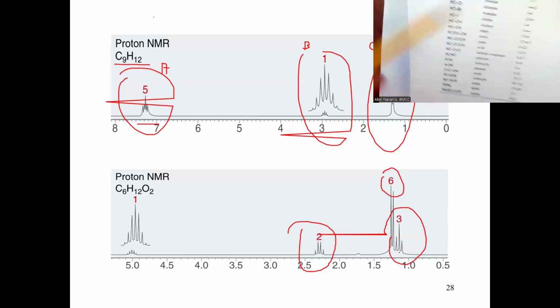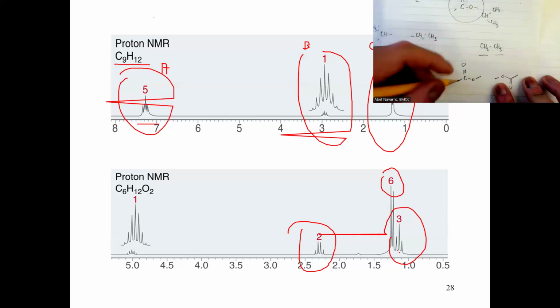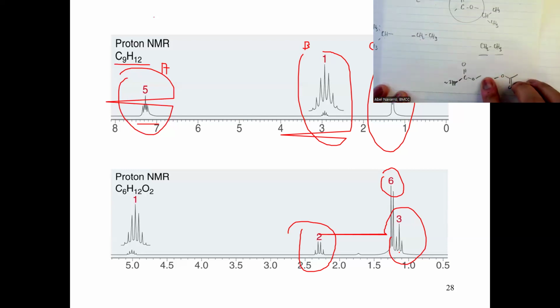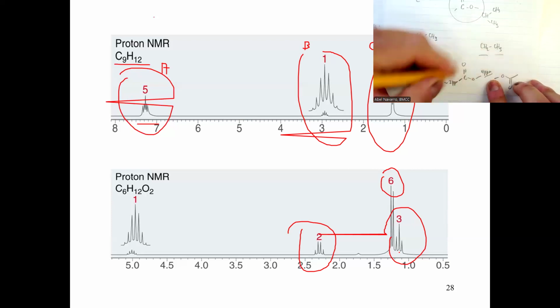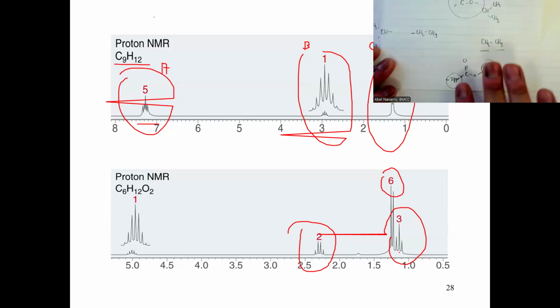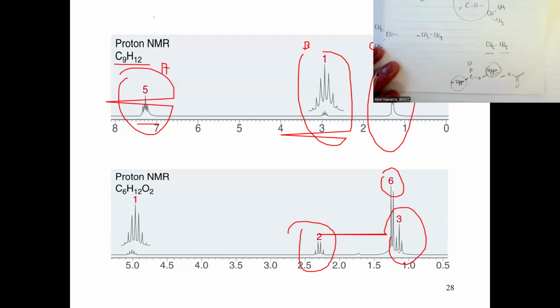Is between 2 and 2.7. So basically, if you have an ester, right, this guy is going to be about 2 ppm, and the oxygen side is going to be around 4 ppm. That's how you will know which one goes to the COO and which one goes to the O. Let's go back to the spectrum.